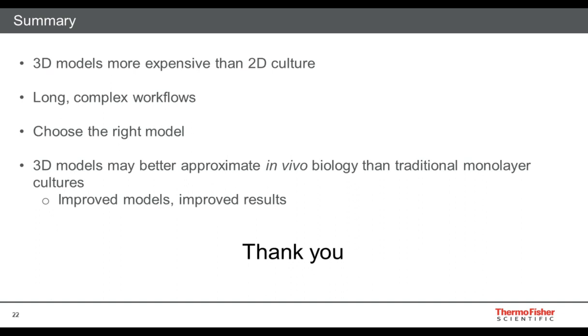And although you can probably control the stiffness of the material, which is a feature that I know some folks are interested in terms of trying to recreate an extracellular environment in vitro that looks more like the ECM environment, in both its biochemical and biophysical properties in the organ in vivo. So although you can probably do some tuning of stiffness of these materials, being able to modify them with other peptides and also retrieving cells from these materials is not a trivial exercise.